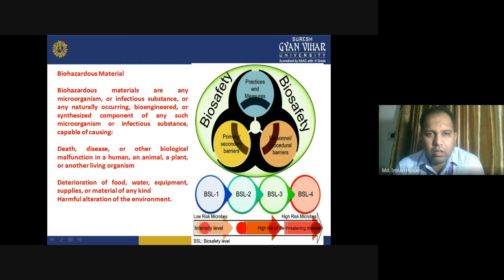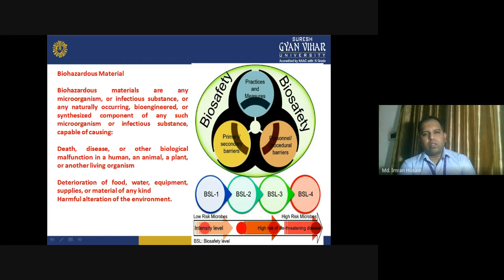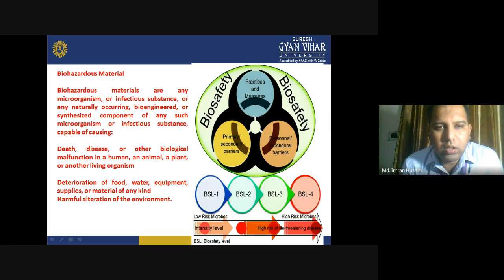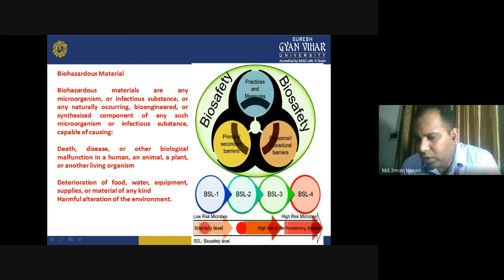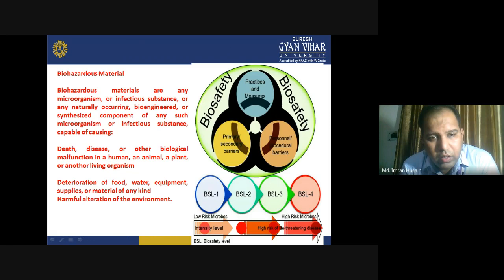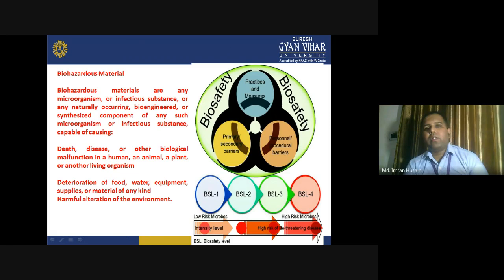If you are not having proper designs, patterns of protection, and protocols, they may create a very hazardous condition. Sometimes these pathogens are bioengineered for the purpose of biological warfare. Deterioration of food, water, equipment, supplies, or material of any kind, and harmful alteration of the environment — any type of alteration is really very dangerous in these conditions.